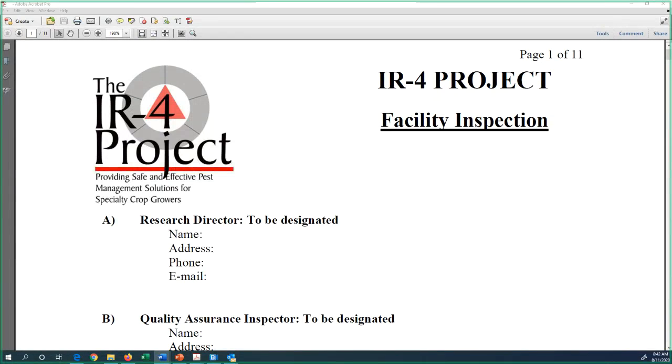Temperature monitoring. A lot of times there's no continuous temperature monitoring. You need to keep files that are not actively used in archives. A lot of times I find either there is no archive, or if there is an archive, the SOPs say that you should limit access to archives.